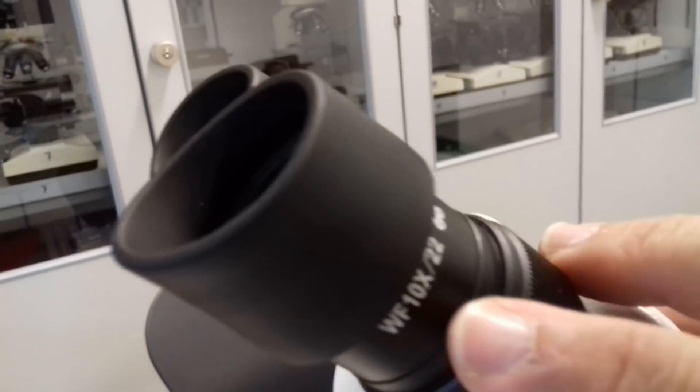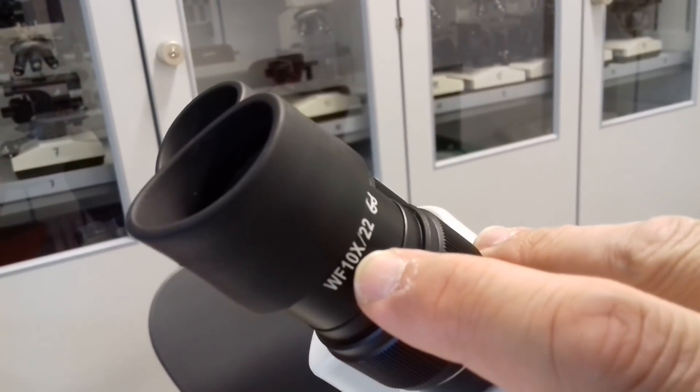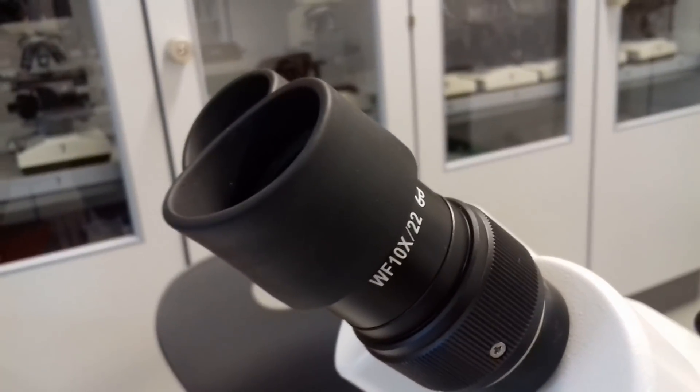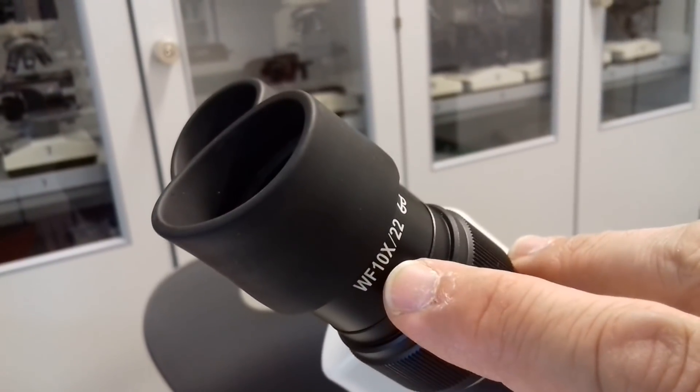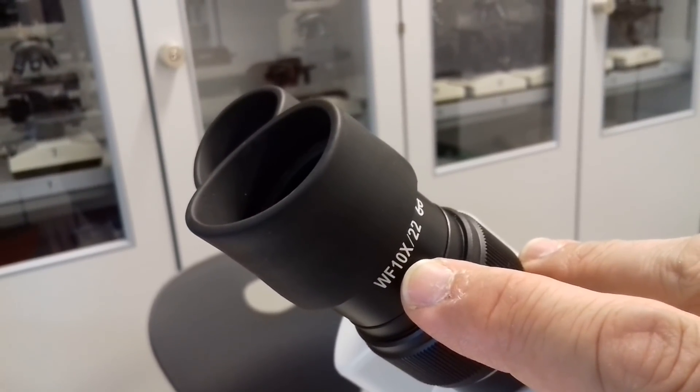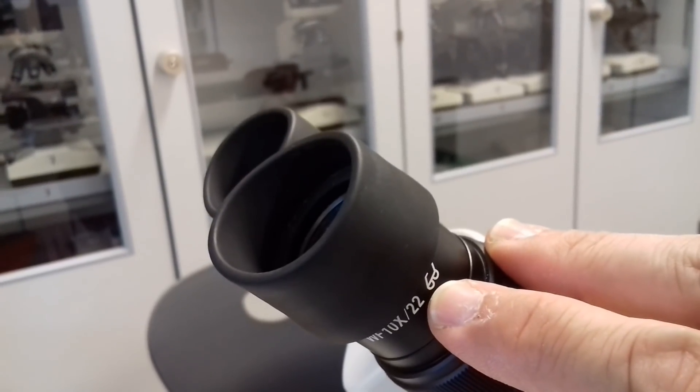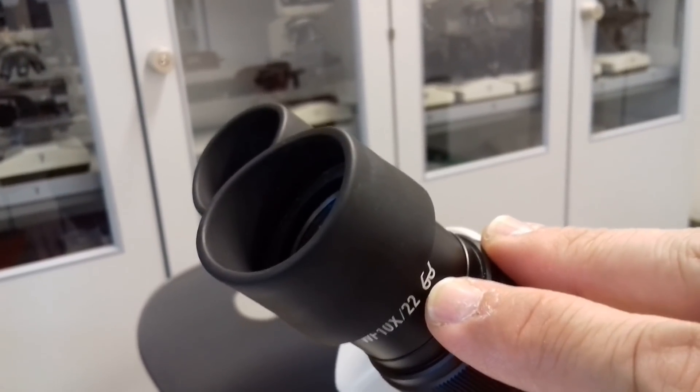So this is a 10 times eyepiece and it says Eurwild field, WF means wide field, 10 times. And then you can also see that there is a number 22 written at the end and this basically tells you how much you're able to see of the object. And it's for eyeglasses, this means you can look through the eyepieces using your eyeglasses on.